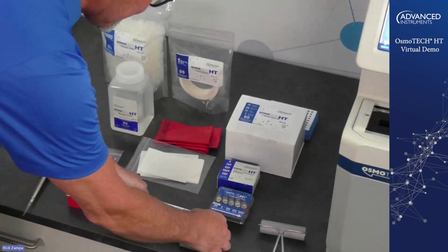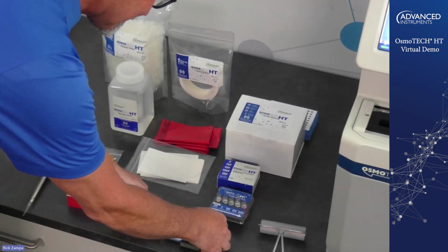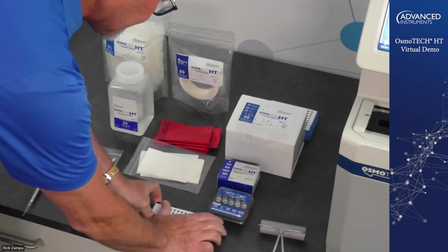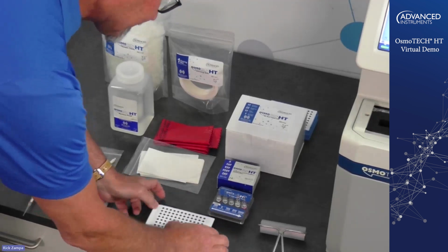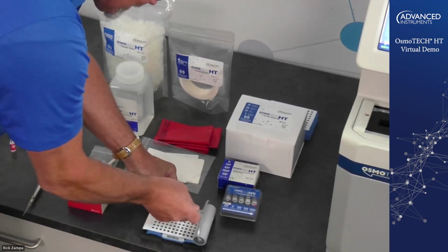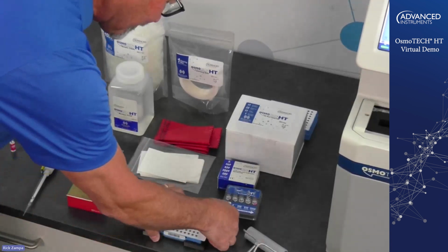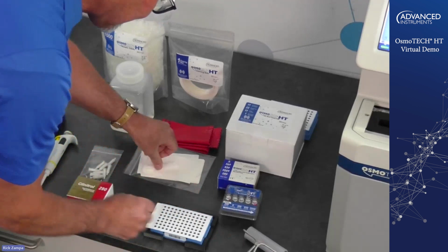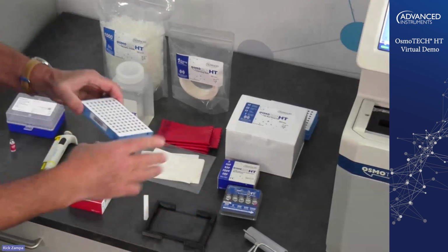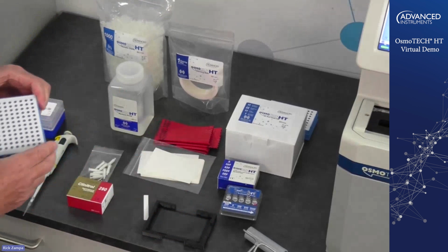You align the evaporation cover over the 96 well plate and press it down. We have a little roller that comes with it just to make sure it gets rolled on tight. You peel off the little tabs. And then we're ready to load it onto the instrument.